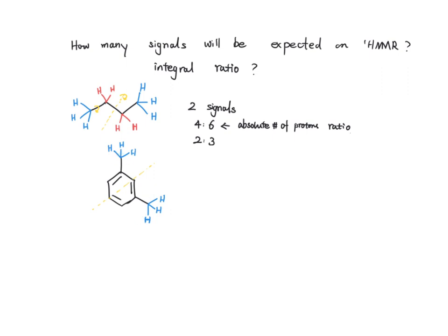And then the second proton we are seeing here is this hydrogen that is on that plane, so it is by itself. And then we have these two red hydrogens that are mirror images of each other, enantiotopic protons. And then there is one more proton right on this.